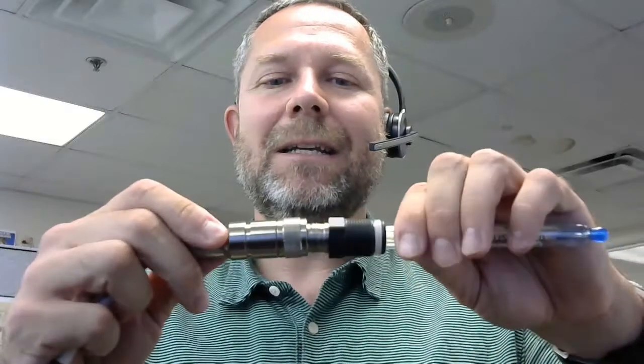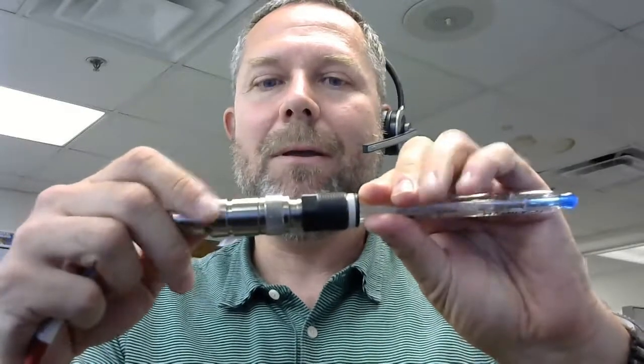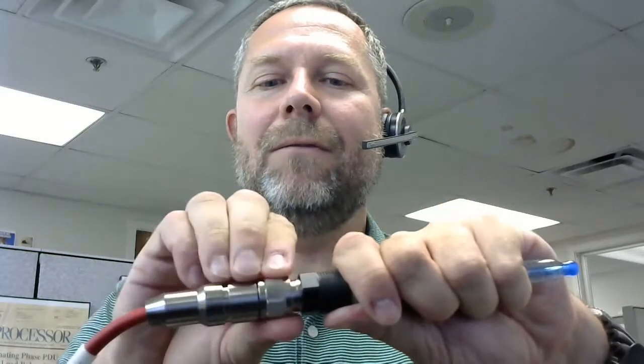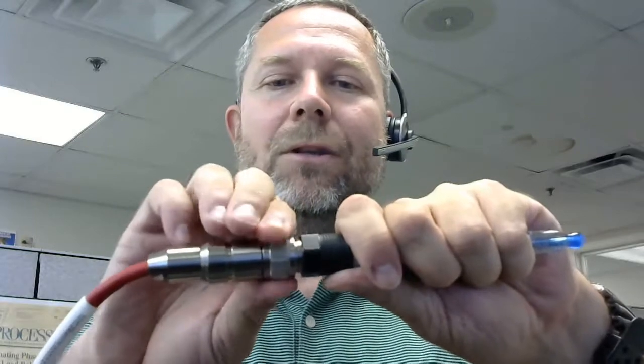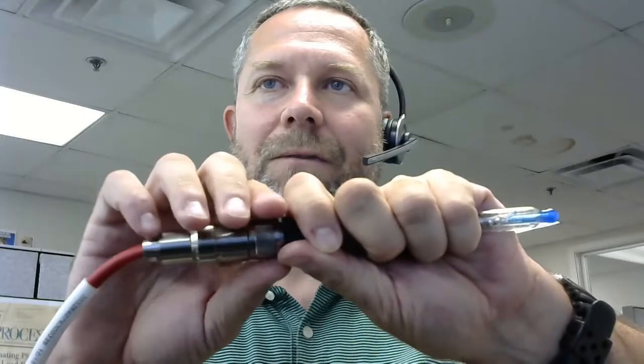The VP connector here has a notch on it, and the female connector on the cable is keyed. If you slowly twist them together, you'll find that notch and key mate up. And when they do, you can slowly thread on the VP connection using this knurled nut. You want to avoid torquing the sensor — have a good grip on the sensor and use that knurled nut to tighten things down. Screw it down until you feel it bottom out.